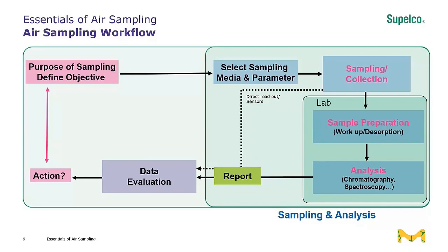In this type of sampling scenario, you do not get the results back immediately. They take several days. Oftentimes, from shipping then to analysis, it can be a week or more. Some laboratories do have expedited testing if you request it. And then the laboratory will form a report from the analysis, evaluate the data, and send it to you so you can make your informed decisions.